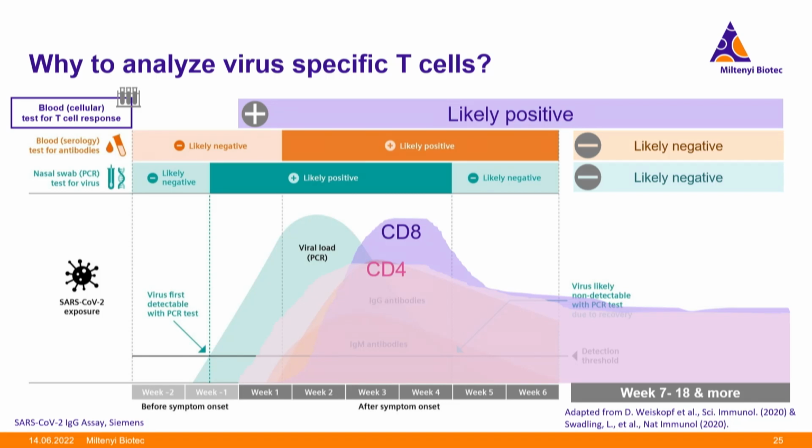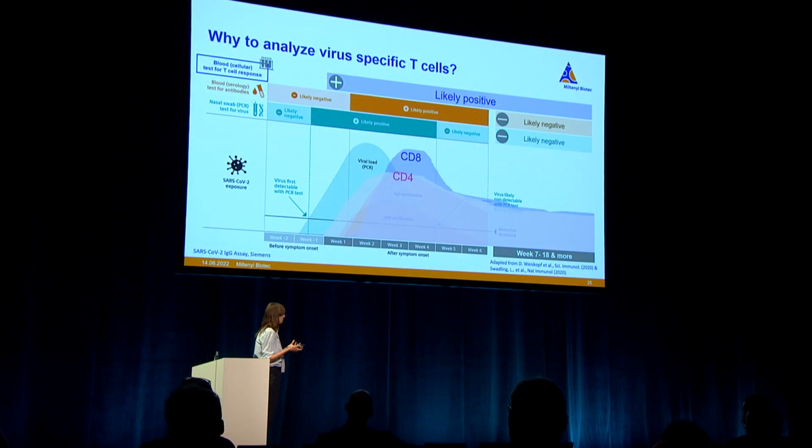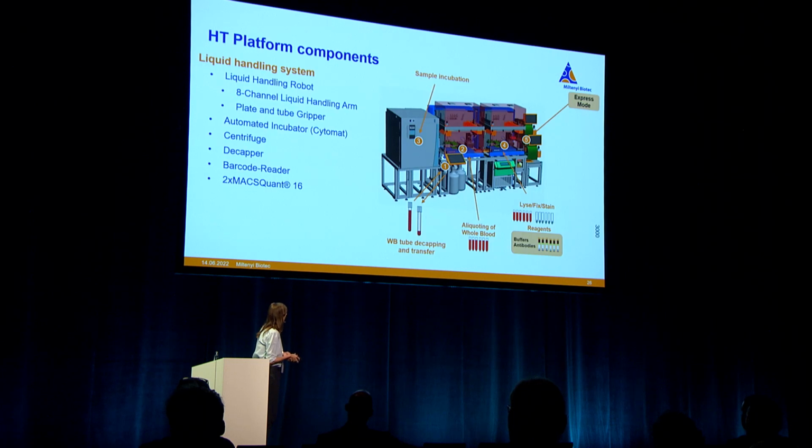The pandemic is very, how to say, it is very dynamic, so our development over here must be too. And so we still look for how to integrate that into the in vitro diagnostic that can be offered to the patients. So that is the lab automation system.